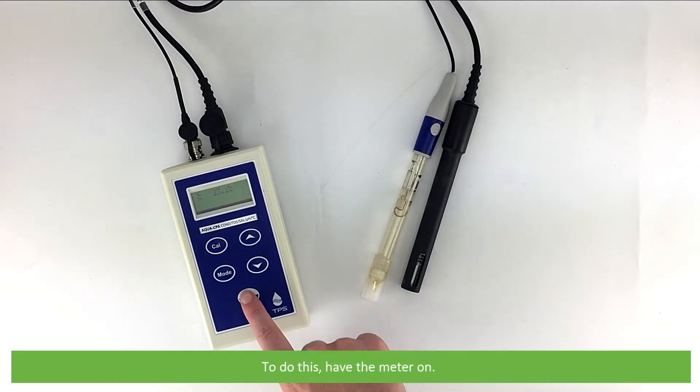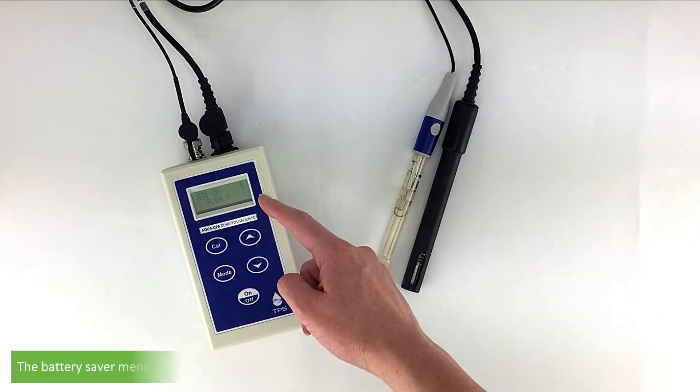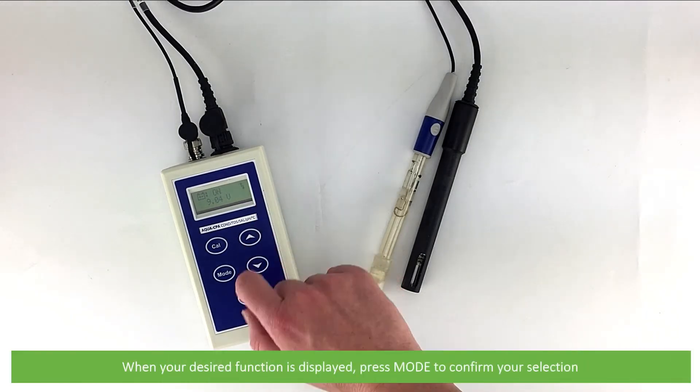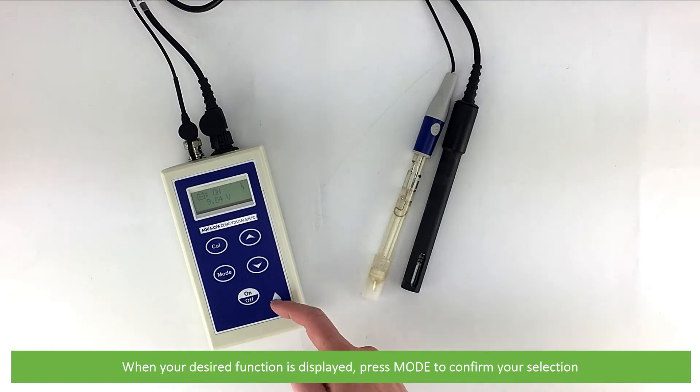To do this, have the meter on. Press and hold the on-off key for 3 seconds. The battery saver menu will display. Then use the up and down arrow keys to turn the battery saver function on or off. When your desired function is displayed, press mode to confirm your selection.